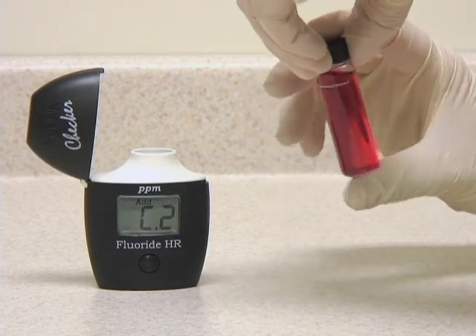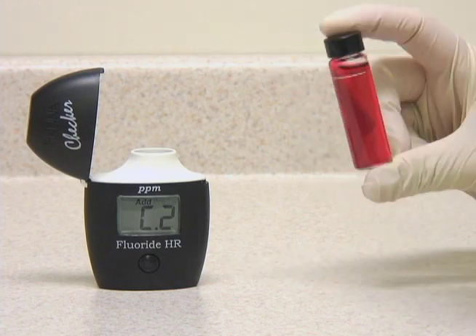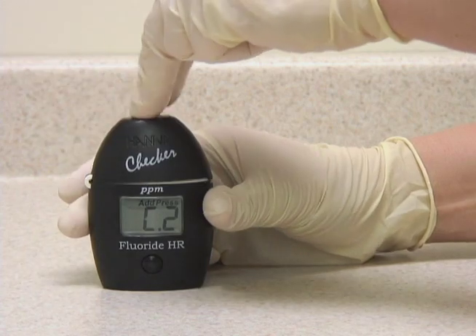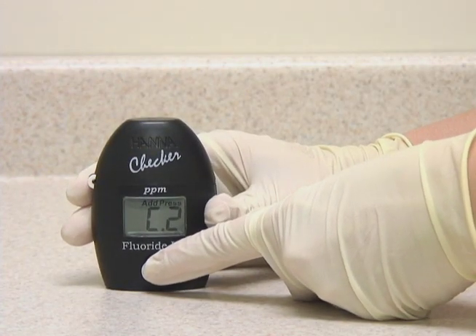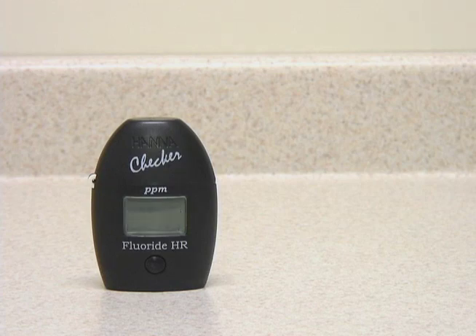Now we're going to invert several times to mix. Place the vial back in the meter and press and hold the button one more time to activate another one-minute countdown. Now the checker has taken a reading and is directly displaying the fluoride levels in parts per million.